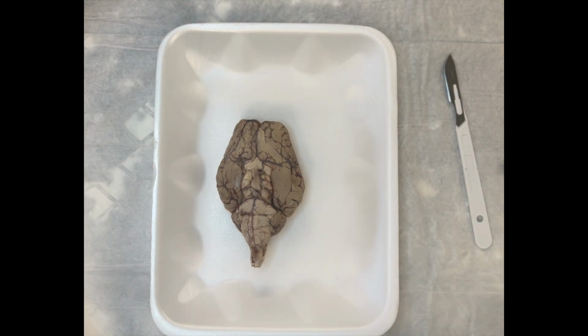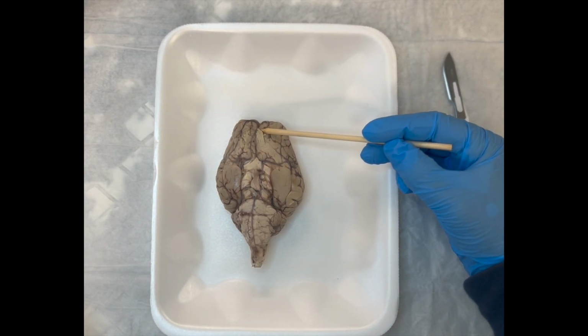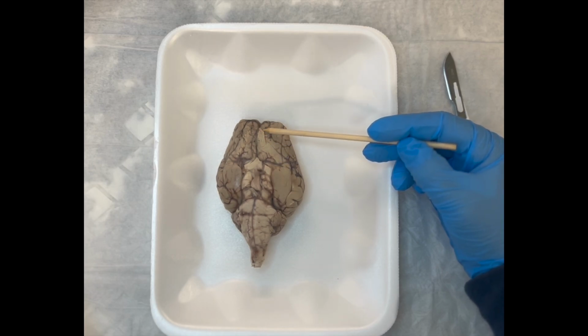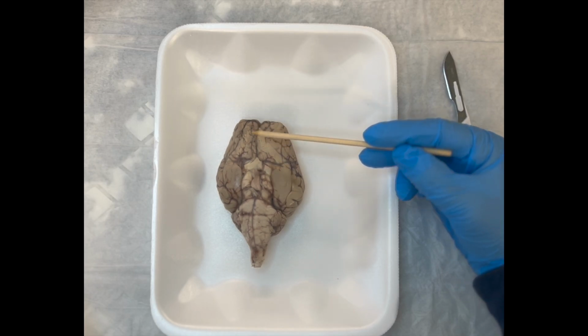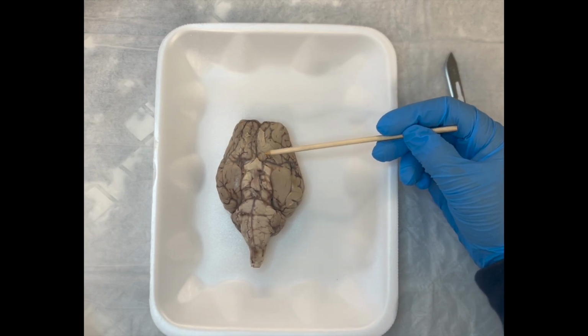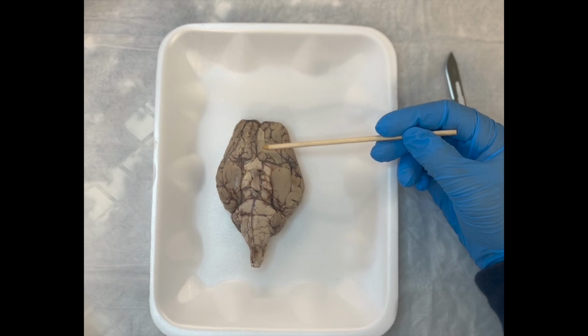Olfactory neurons dangle down from it and are responsible for our sense of smell. So olfaction, olfactory has all to do with the sense of smell. So that bulb then leads to this olfactory tract being shown there. So this side I can see it okay. This other side I really can't see it much at all. It's going to depend on the brain that you have.